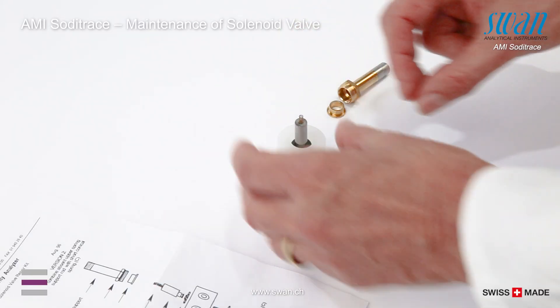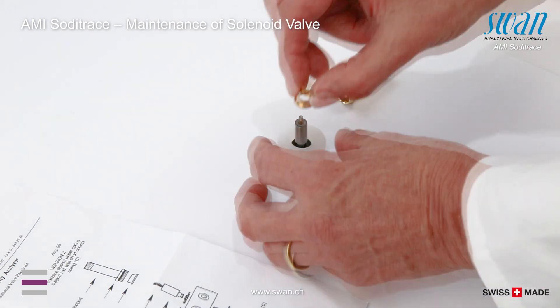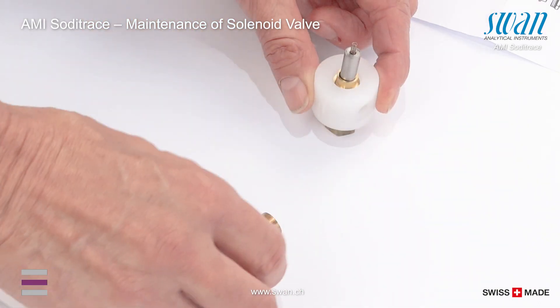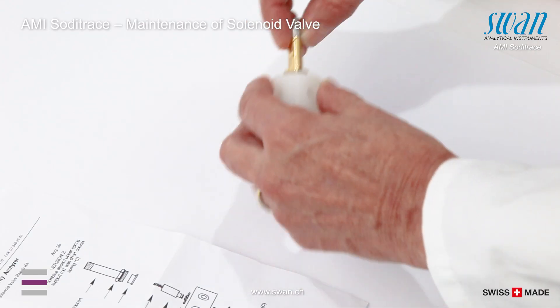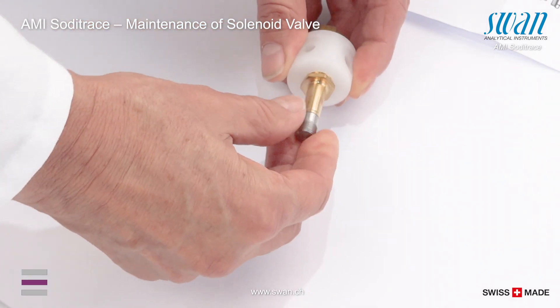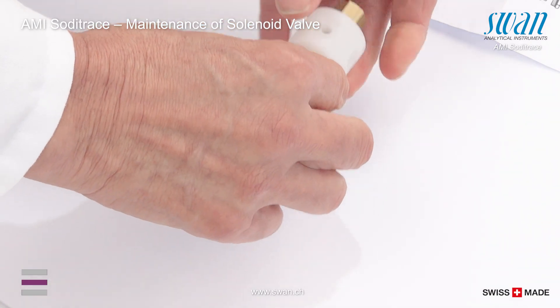Place the long spring in the solenoid. Place washer two on the membrane and push down carefully. Screw the solenoid support finger tightly.